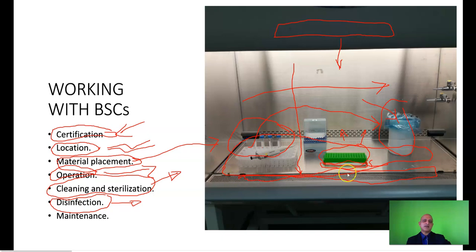And then you can clean the area below and disinfect it with a specific agent and with the specific contact time. And finally, there's the maintenance schedule. So you have breakdown and periodic maintenance in your SOPs.